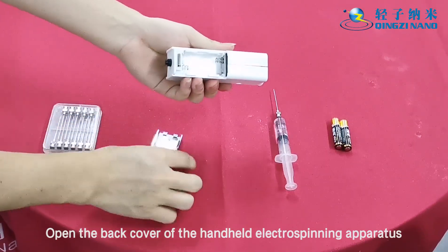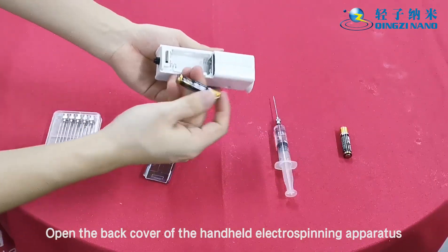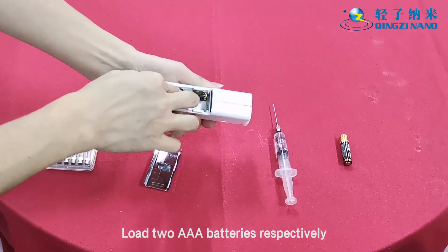Open the back cover of the handheld electrospinning apparatus and load the 2 AAA batteries respectively.